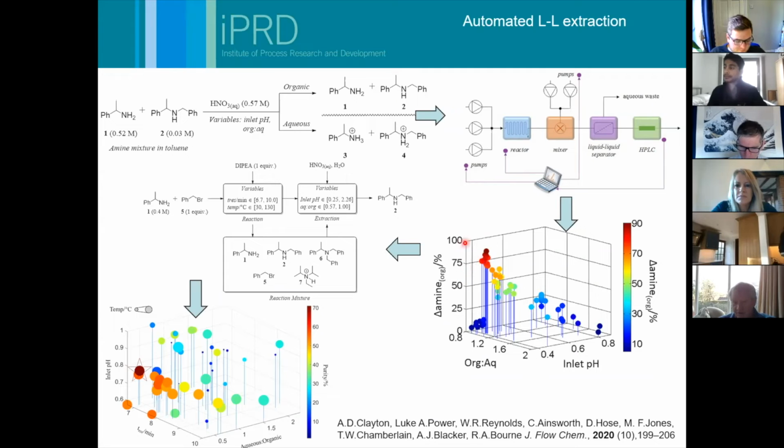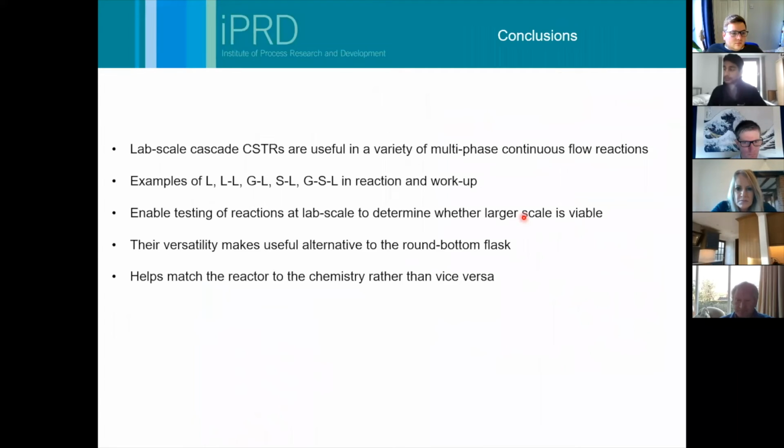ratios. And we took that a step further by actually doing a reaction and then separating the products in the reaction to try and give us an optimum separation, which is seen in this diagram here. And again, the optimum is over here, where we select an optimum amount of product without the impurities in there. So this is a liquid-liquid extraction using the fReactors for an automated separation.